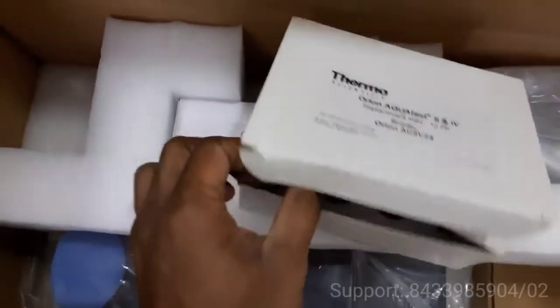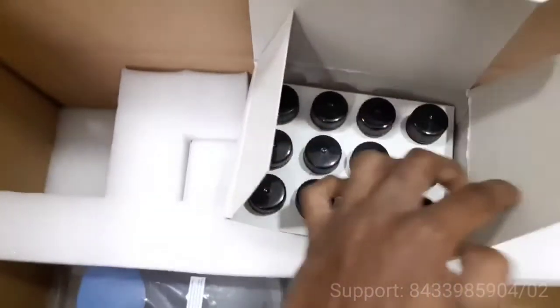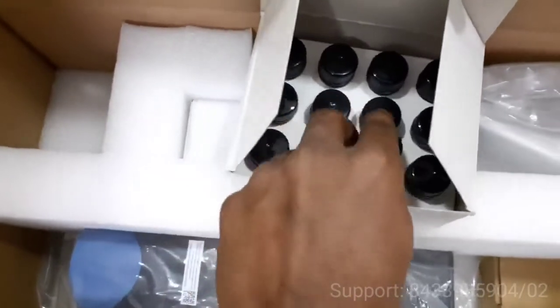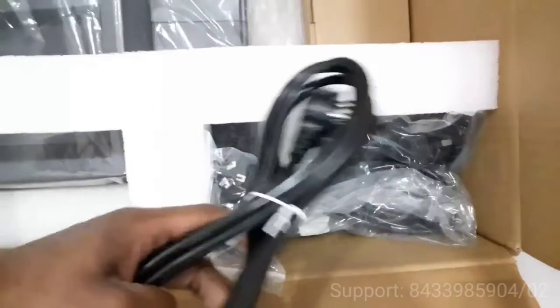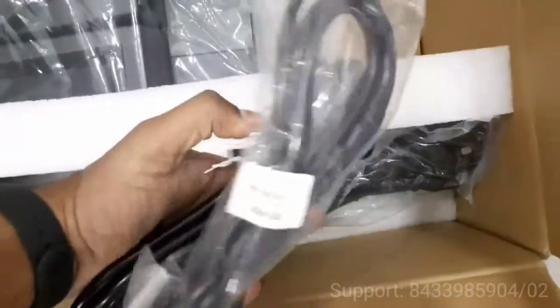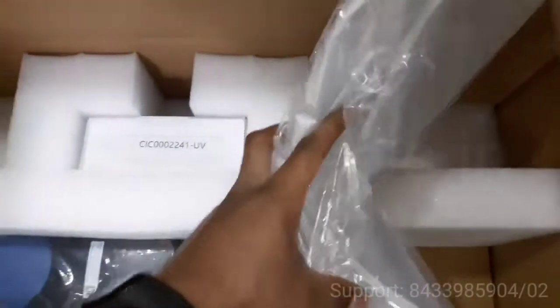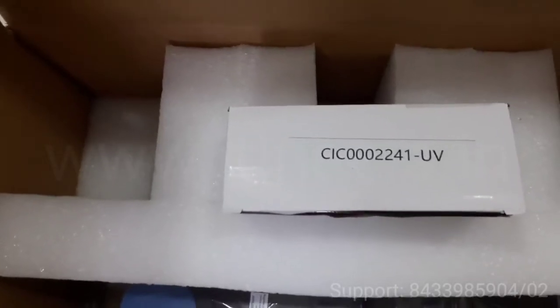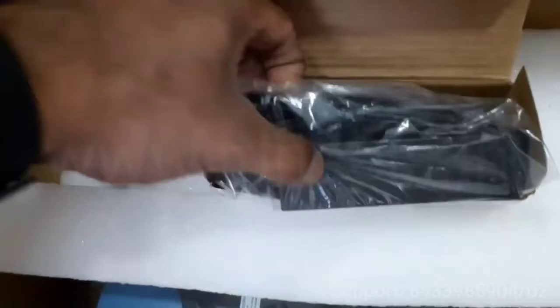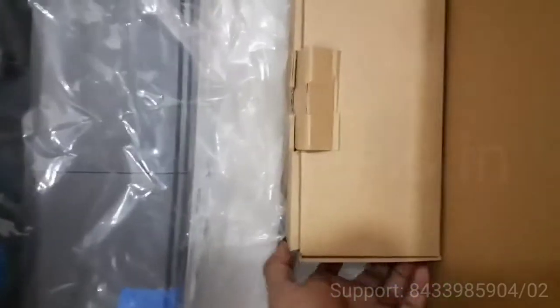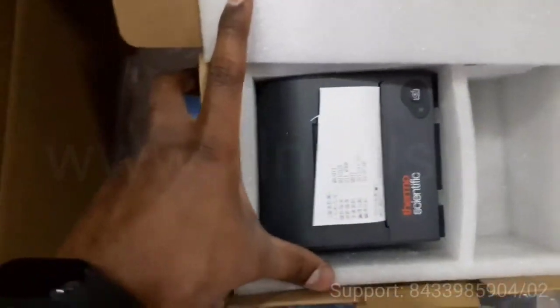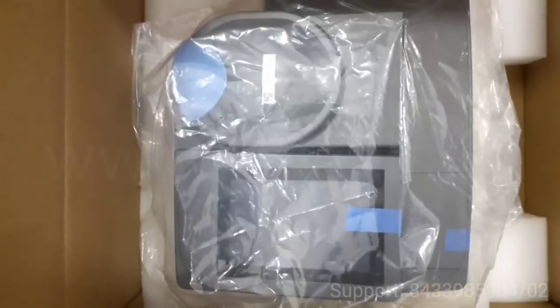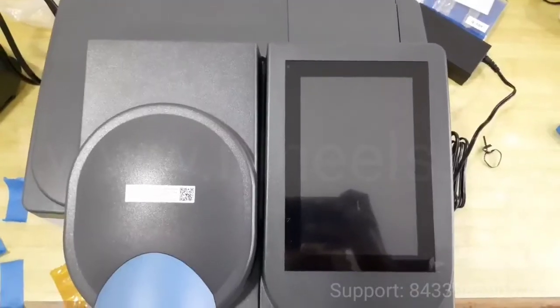Three different power cables are included. This is the dash cover for the spectrophotometer. This is the power adapter. This is the snap-on printer which you can attach. And finally, this is the spectrophotometer.